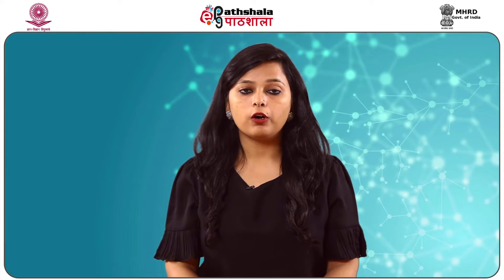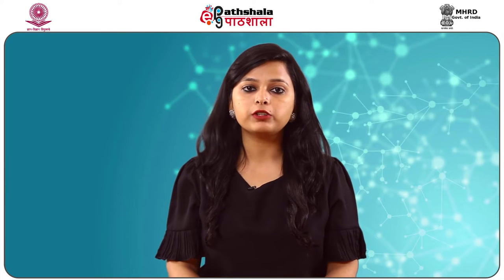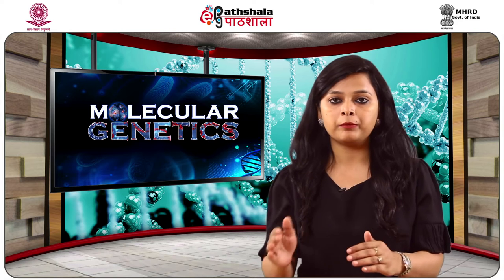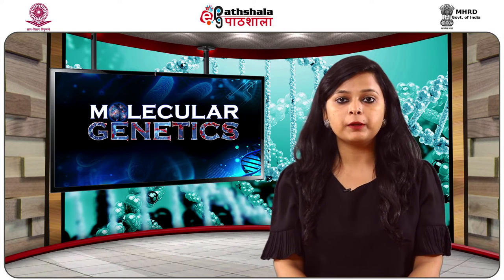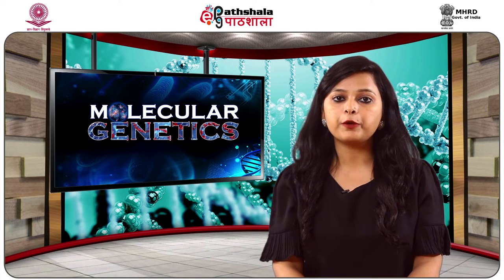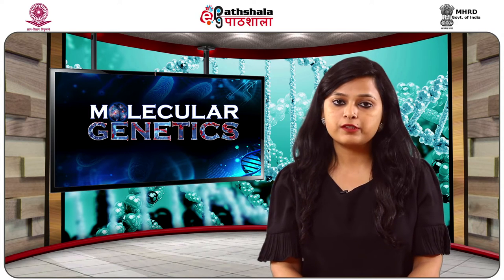sequences immobilized on the membrane. To detect the exact location of the labeled probe, the membrane is covered with an X-ray film, and subsequent to development, the location of the probe becomes visible.